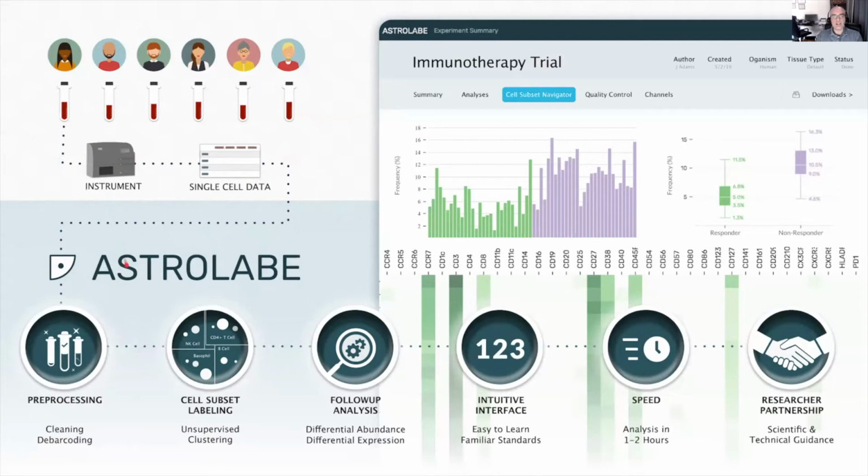Astrolabe cleans the data. Astrolabe can debarcode CyTOF data, identify cell subsets, conduct unsupervised clustering, and fulfill the role of the biostatistician by doing all the follow-up analysis. So if you want to identify cell subsets that differ in frequencies or markers that differ in intensity across your experimental conditions, Astrolabe does all of that.